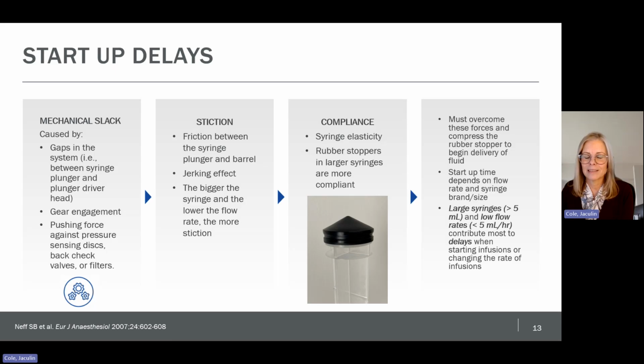So it's not the traditional definition of the word compliant that you might be thinking of, because in this case, something that's more compliant is bad and something that is less compliant is good when it comes to flow rate continuity. Syringe pumps must overcome all of these forces, and they have to compress that rubber stopper before the delivery of fluid can occur. And startup time depends on flow rate and syringe brand and size.